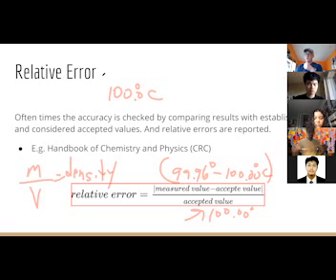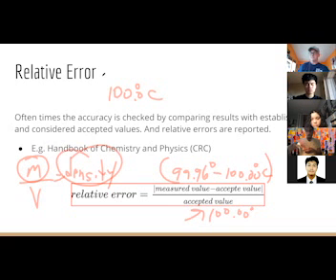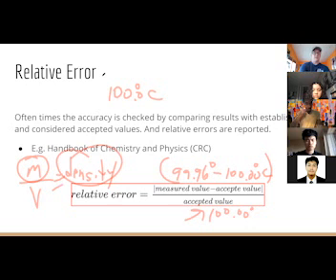That's why we need the thermometer for today. That's the whole point of the thermometer, because we're going to measure the precise temperature of our water, so then we know what the density is. We'll measure the mass, we'll know the density, and if you know those two things, you can calculate the third.